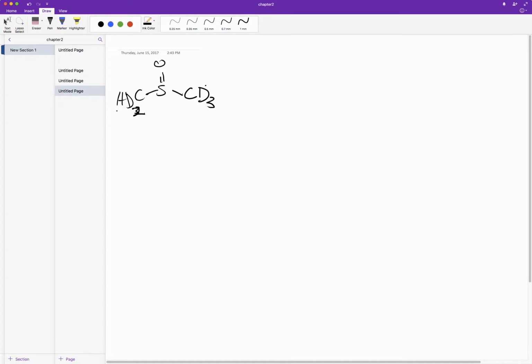But there's always a little bit of impurity in your deuterated solvent where there are a few molecules that have 1 extra hydrogen that should be a deuterium. And we call this proton the residual solvent proton. The chemical shifts of these residual solvent protons are very well known, and you can find tables of them on the internet.